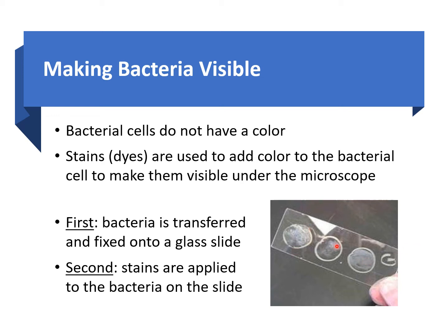Now, if you're not going to put multiple samples, we usually do not draw these circles, but sometimes, especially for students who, let's say, it's their first time making a slide, drawing that circle does help them when it's time to find the specimen under the microscope.